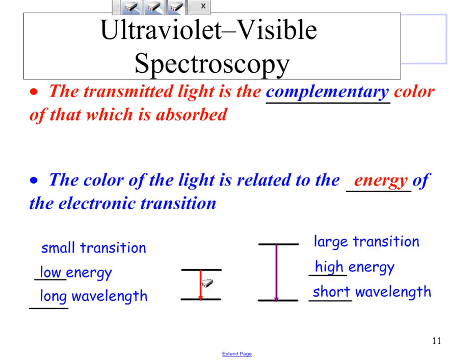And as I mentioned before, only certain wavelengths can work. It needs to be the exact wavelength to jump from the low energy to the high energy level. If it's not the exact right wavelength, nothing happens. That's what we call something that is quantized.